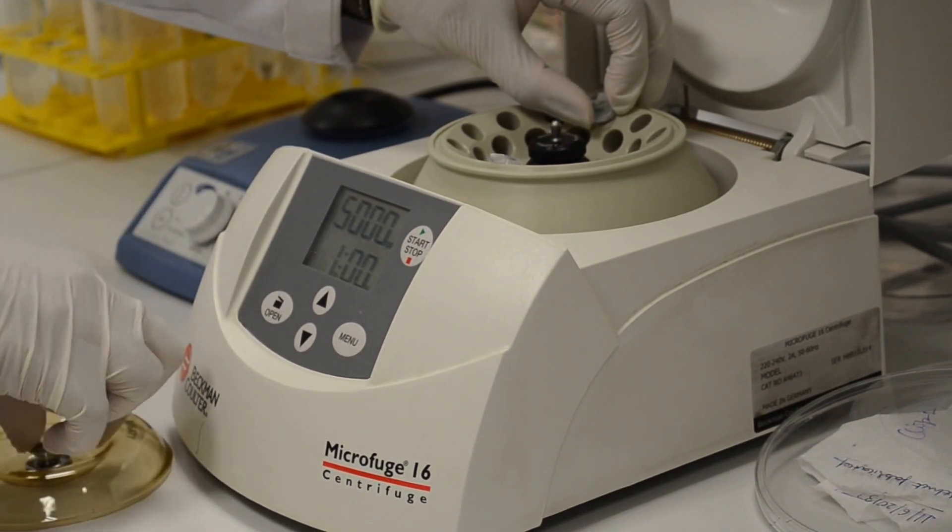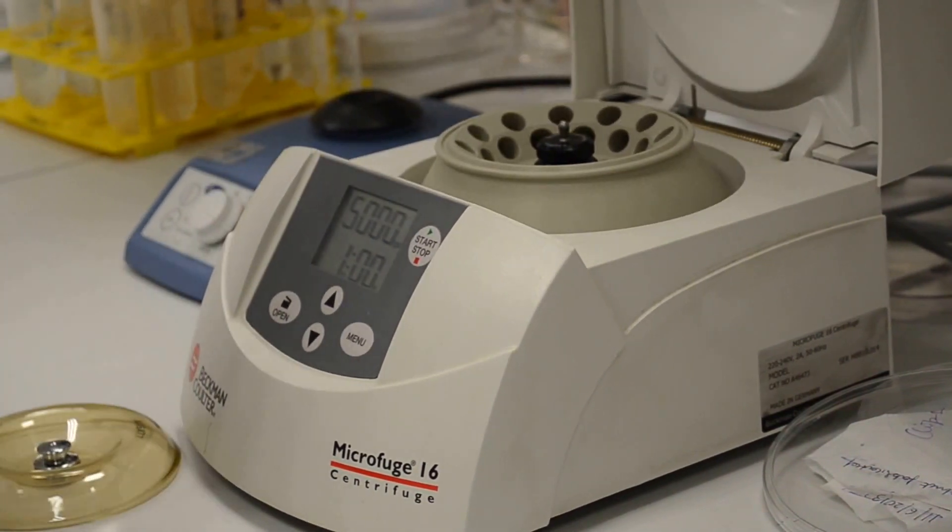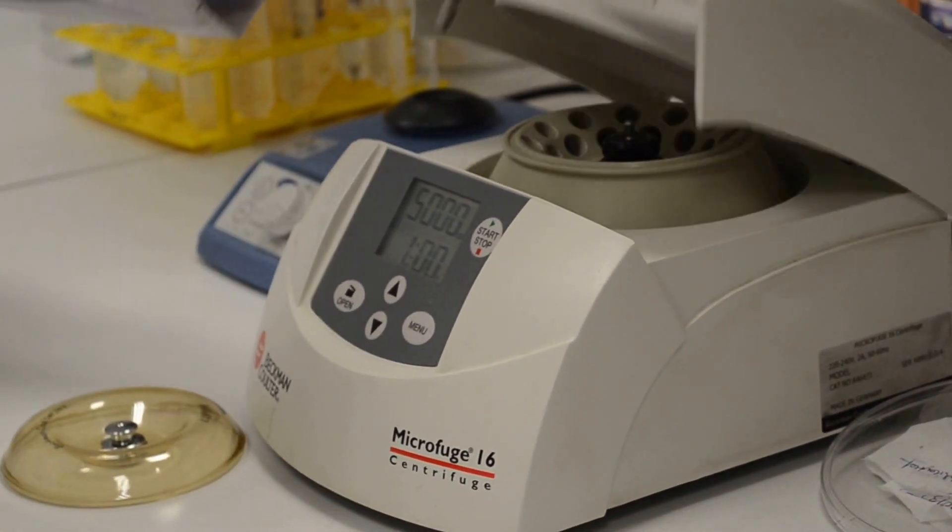Now the tubes are centrifuged and the supernatant will be taken out. After taking out the supernatant, we will come back and see again in the UV transilluminator.